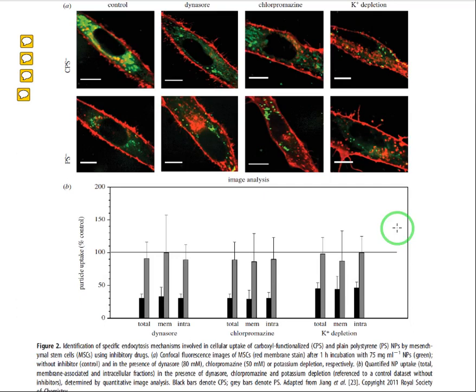Well, if you remember, within the previous videos we talked about fluorescence microscopy and the use of fluorophores for these imaging techniques. We mentioned that different fluorophores with different colors can be functionalized with groups which have certain specific affinity. Affinity means attraction towards different parts of the cells. For example, we can get red fluorophores and equip them with functional groups which have affinity towards the cell membrane. So as you see here, when they are introduced, they will stick all around the cell membrane.